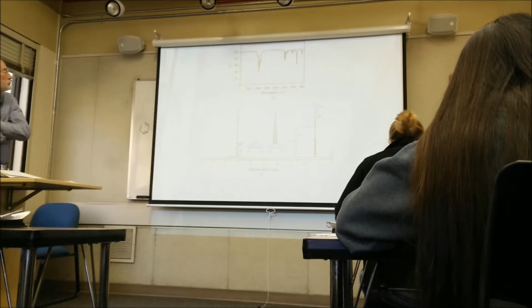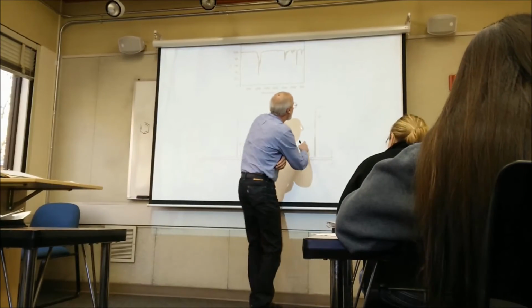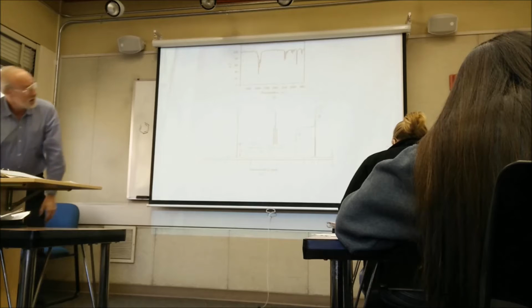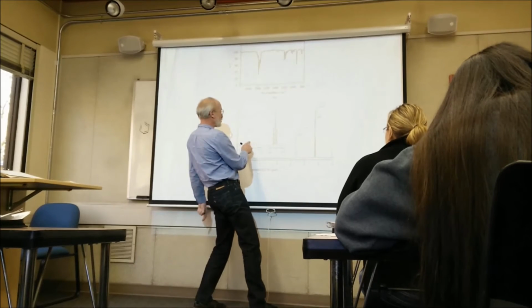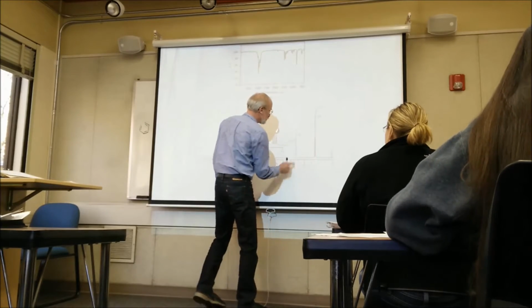Substitution pattern. So it looks like the integration is 12, 12, and I think this says 17. Yes, 12, 12, and 17. And these two are triplets. Oh yeah, here's this one, and this is a quartet. Yeah, this is a quartet, and this one is a triplet.